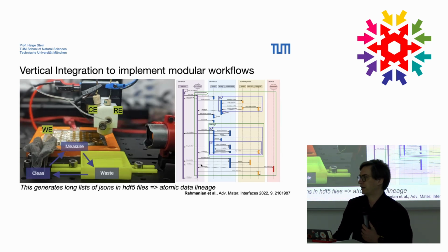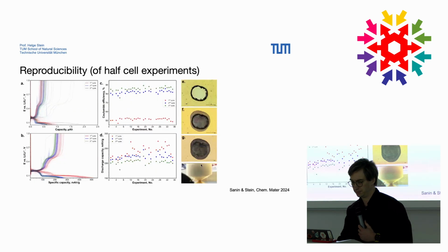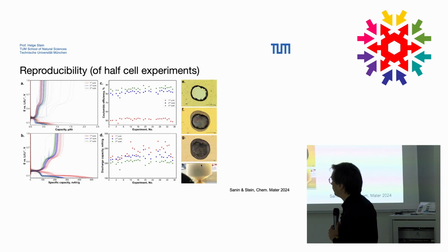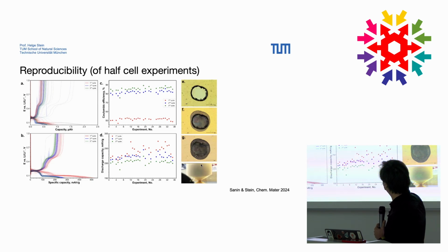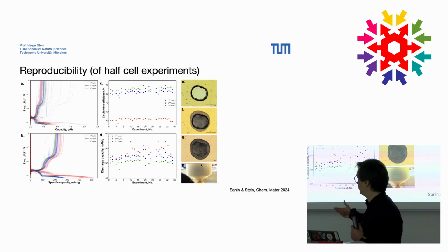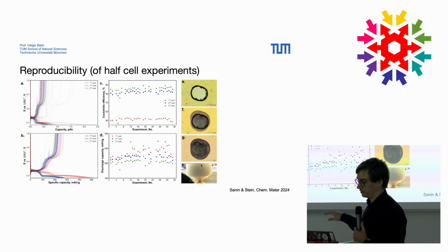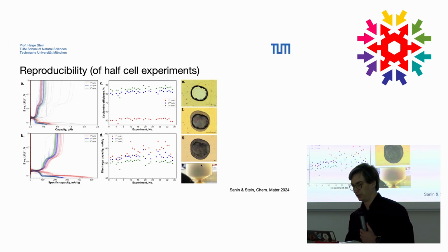Again, really the technology that underpins all of this is FastAPI with a nice Python backend and frontend. So we are able to achieve quite nice reproducible results for very little material need. This little yellow material here is actually gold. Because gold is nicely reproducible in terms of sputtering, we produced here 36 gold anode batteries, and our Coulombic efficiency and our discharge capacity are all within a relatively small error band.